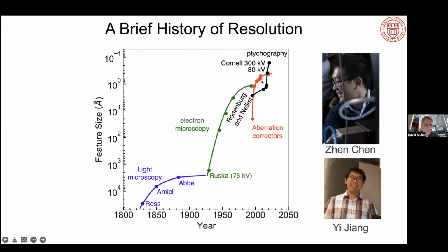And so it was very much an area left to true believers, of which there are maybe only 2 or 3 groups in the world. And instead, ptychography migrated over to the X-ray community, where the instrumental demands were more compatible with the kind of data that you had to take. And it was really only when we got the detectors up and running that we were able to get results that people in the microscopy community paid attention to.